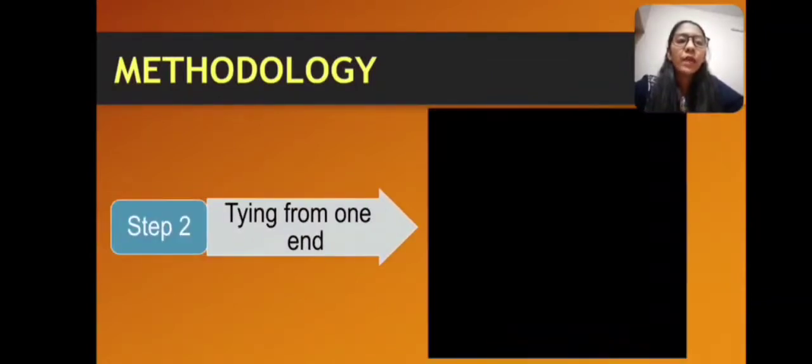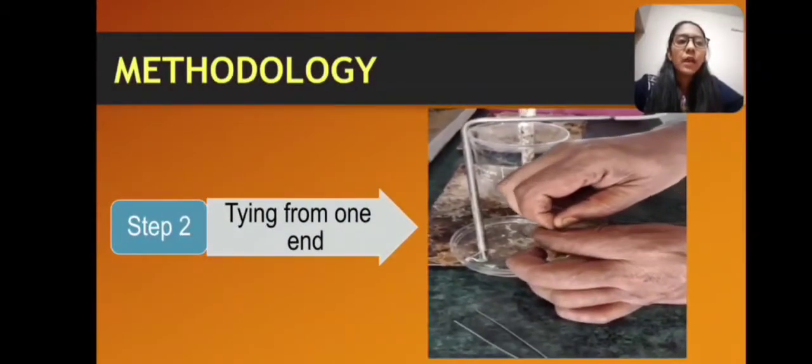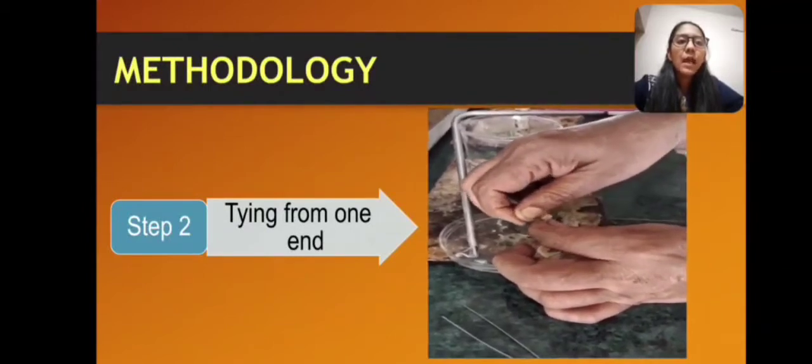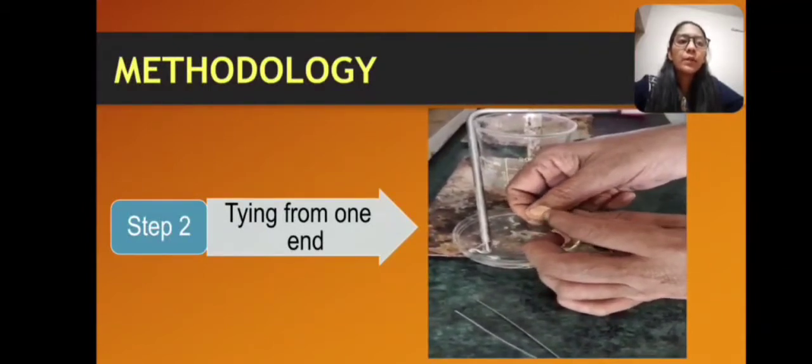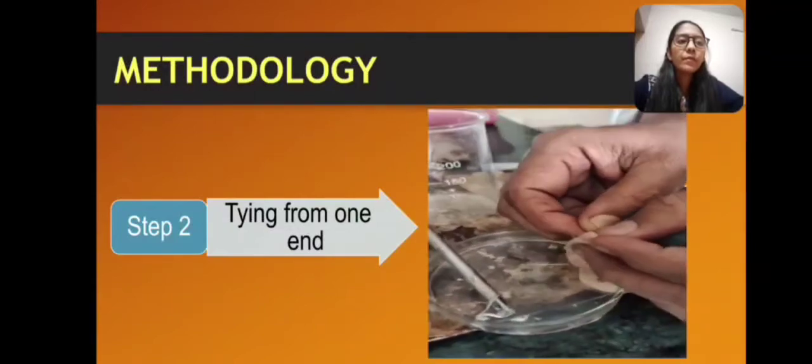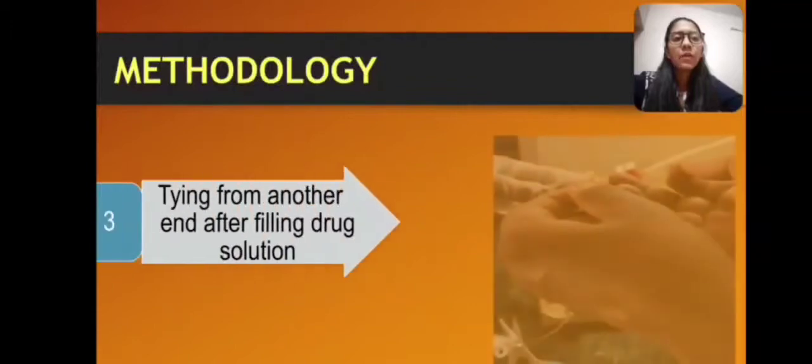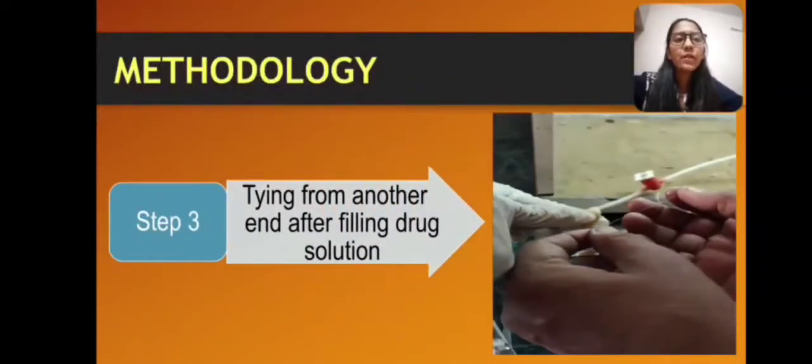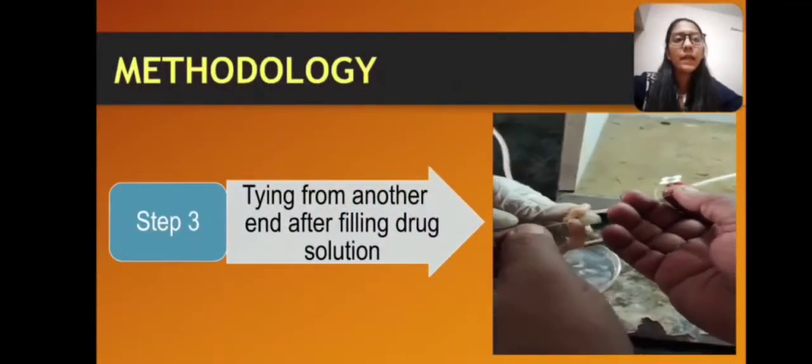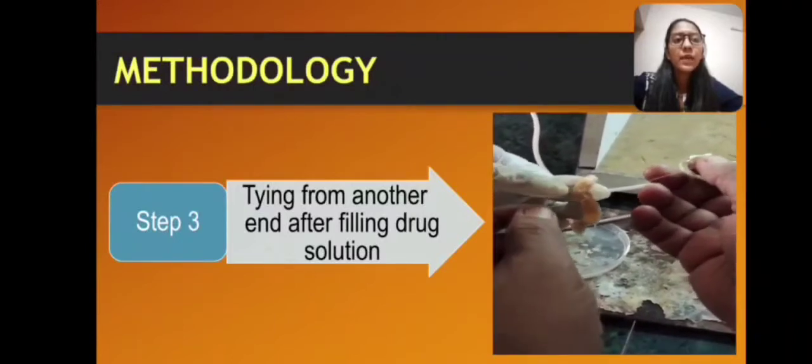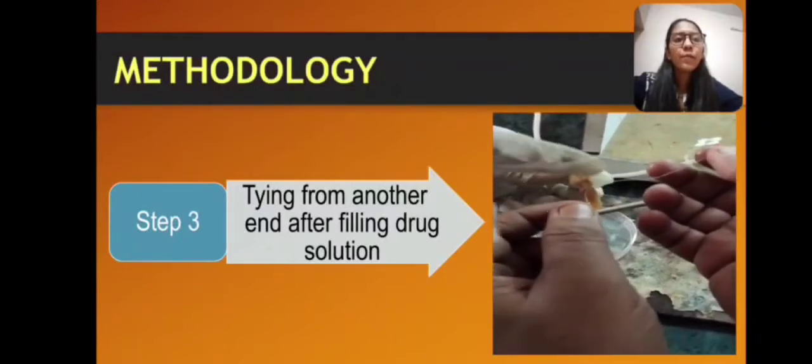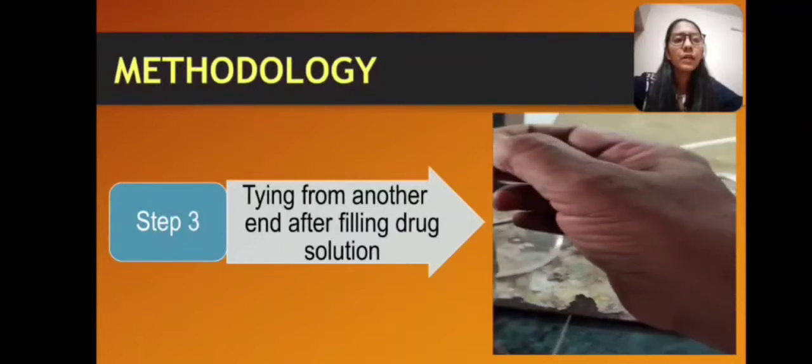Step three: after tying its one end, fill the drug solution into it and tie its another end. As we can see in the video, we have to tie both ends properly so that the drug will not leak.